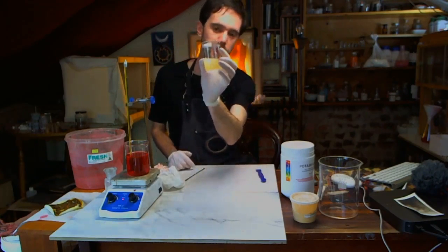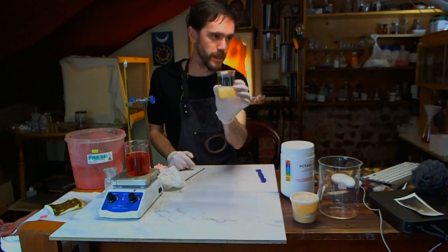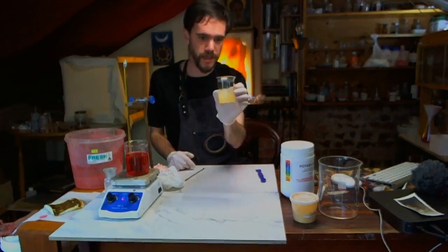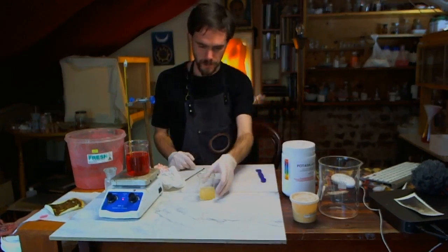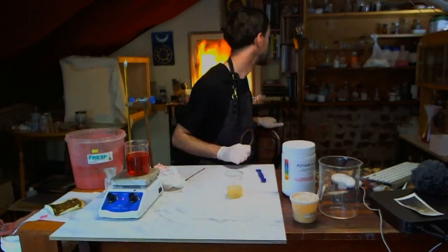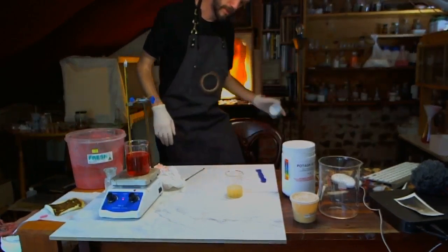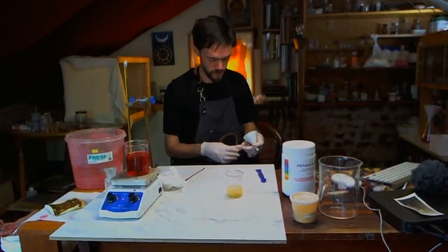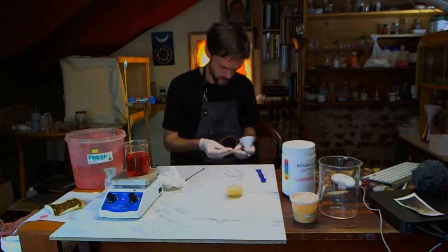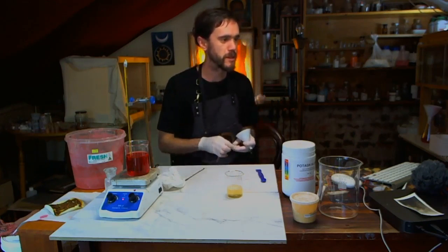As you can see, because it's not completely pure, I don't know what the impurities in there are. It's not a completely clear solution. It should be a completely clear solution. So there is obviously some slight degree of impurity in my lead acetate. So we might actually filter this when we put it in there. So let's grab ourselves another funnel. This is at 42 degrees now, so we need to get it up to 50 degrees, like it said.